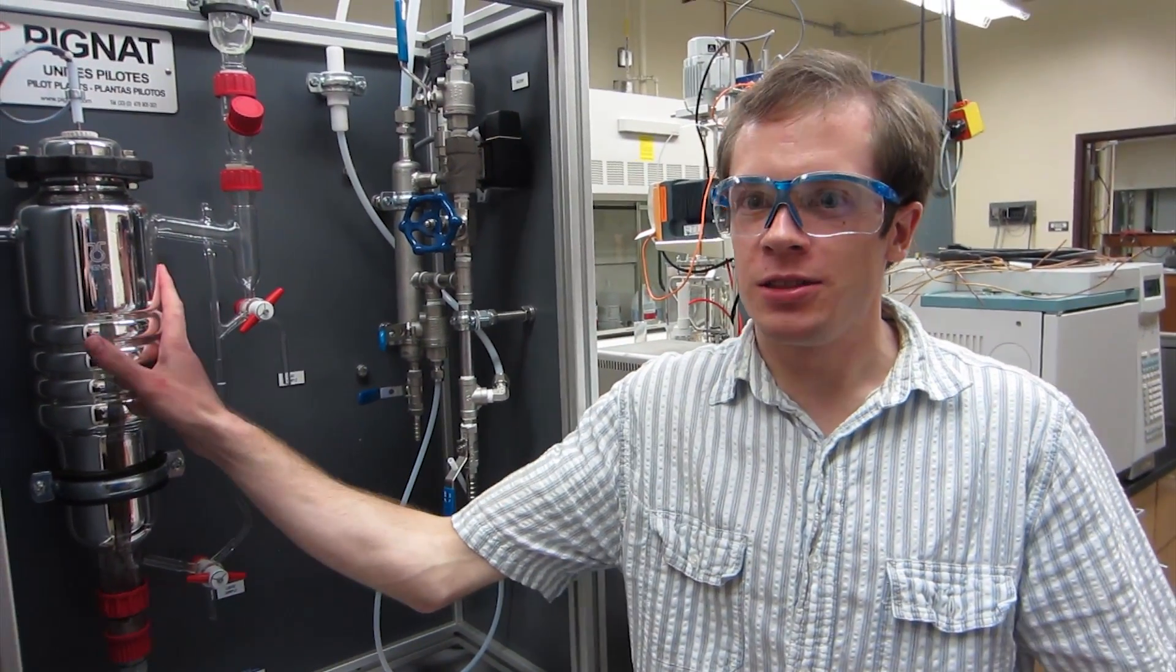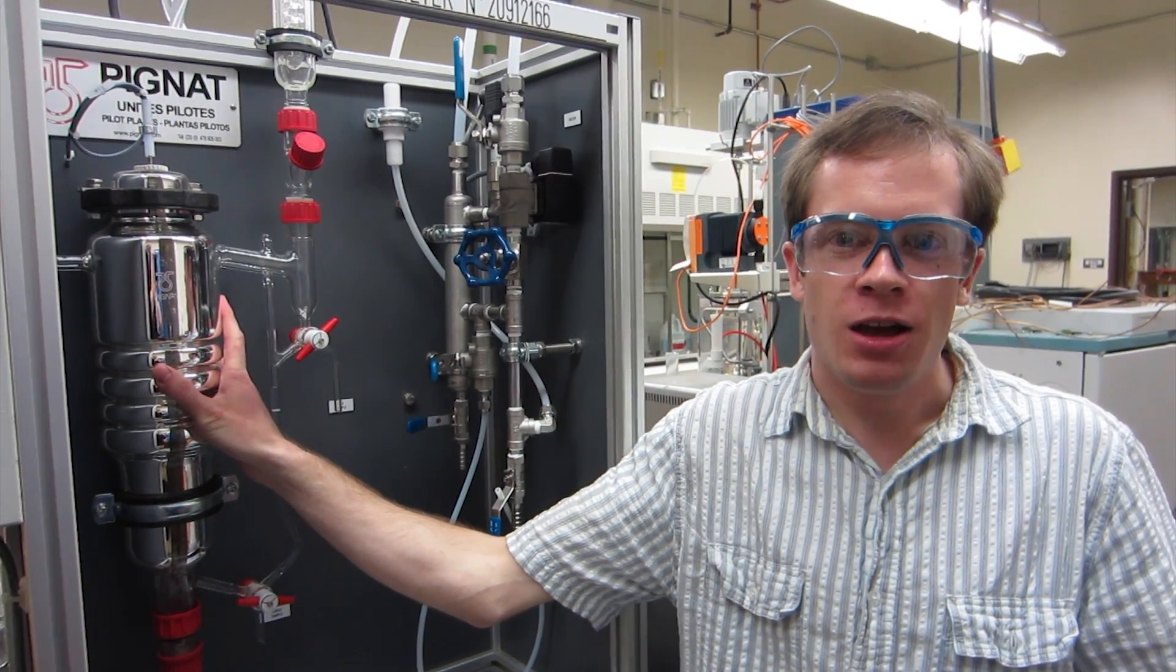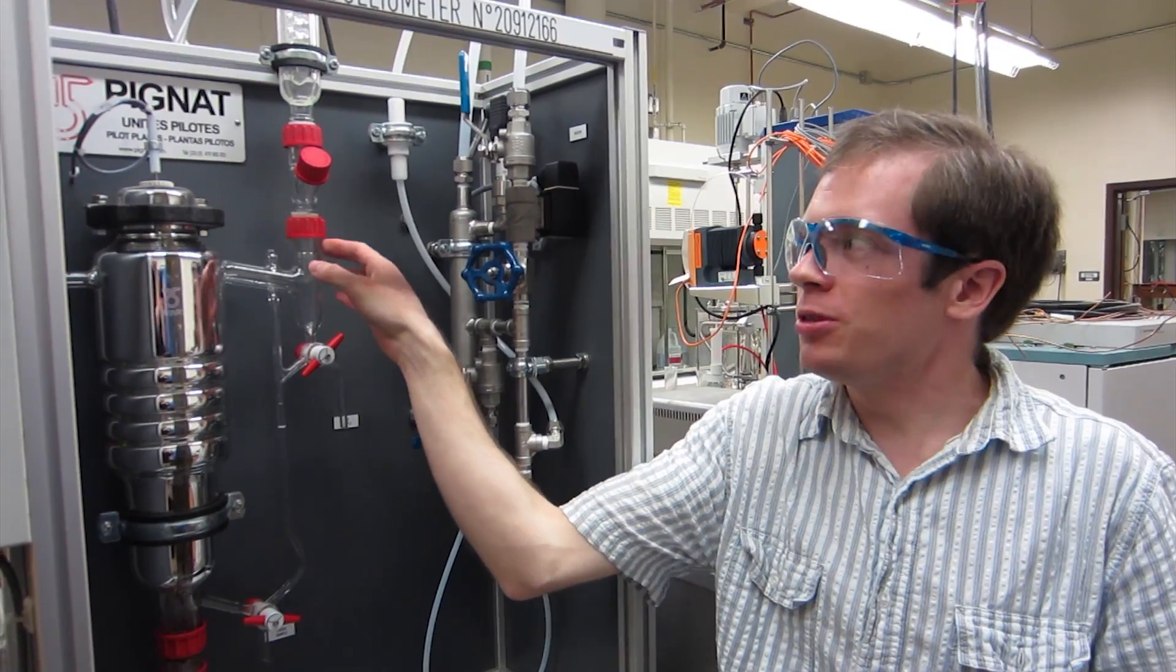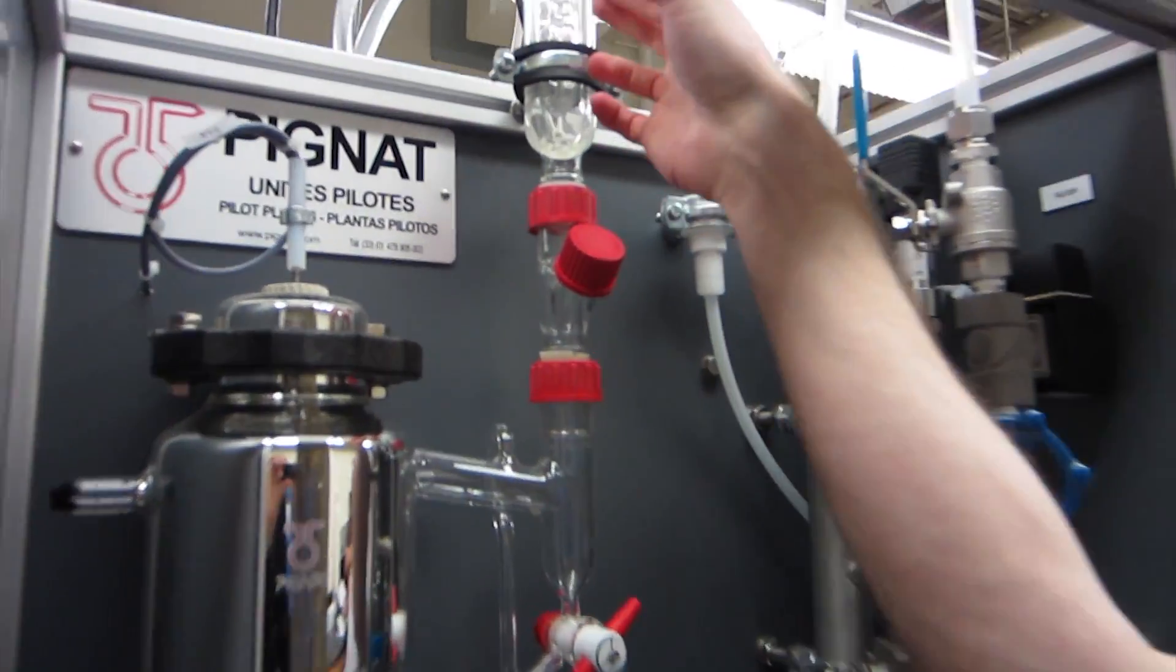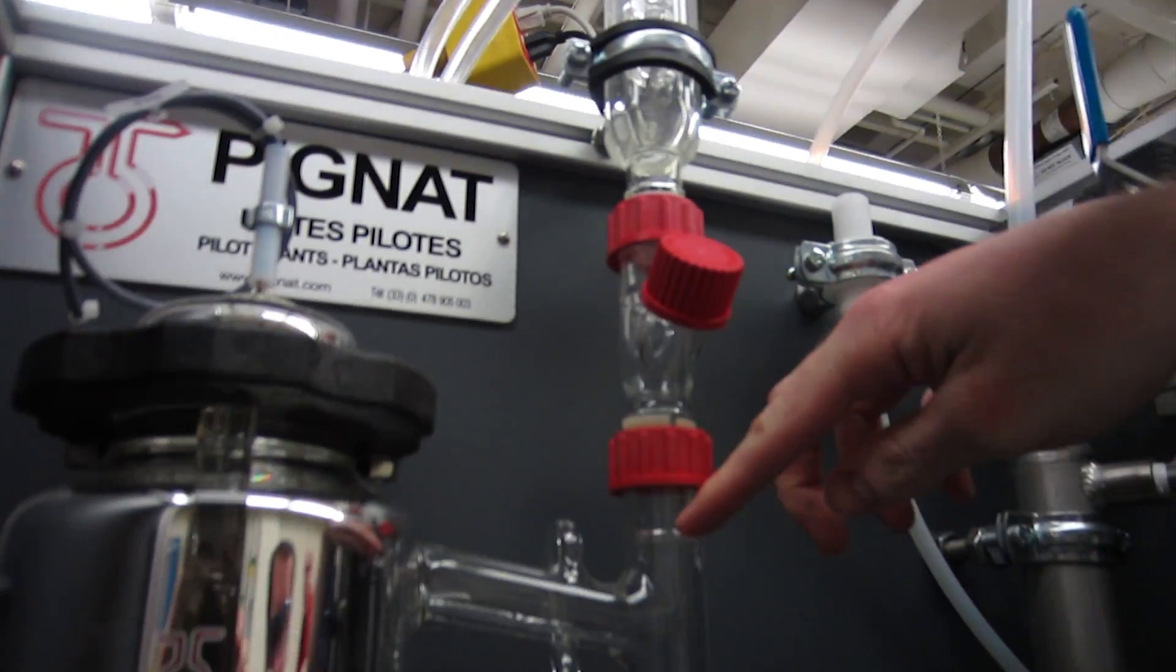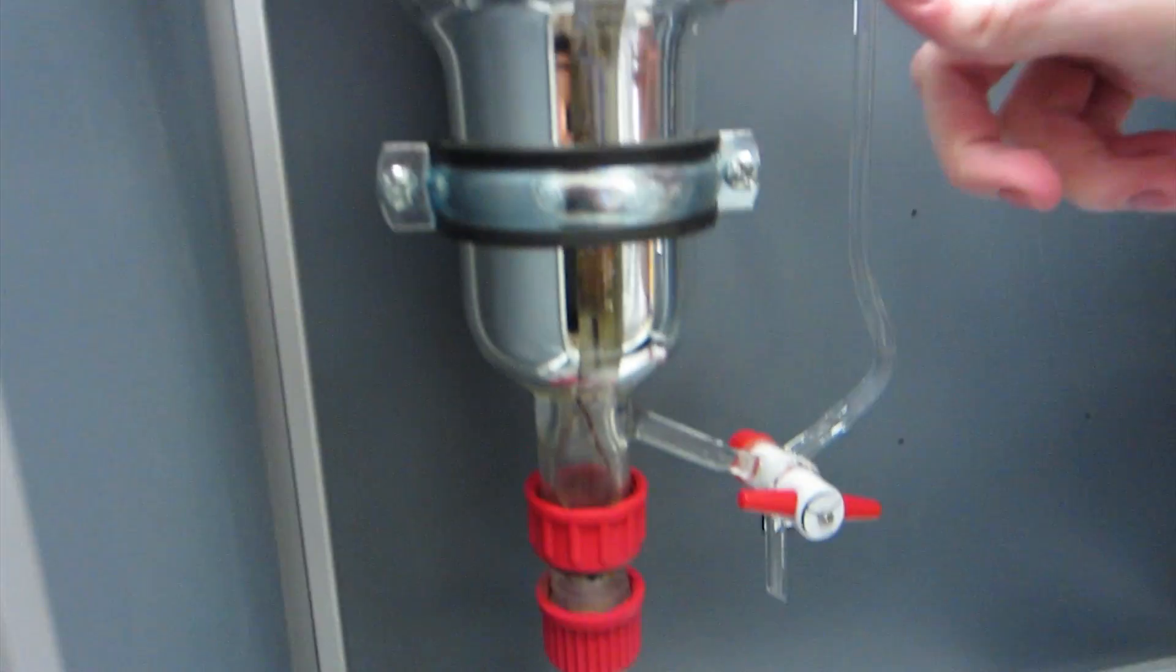So here we've got the reboiler, we just call it the pot usually, where we're boiling the mixture we've got. The vapor comes up through this area up into the condenser here where it all condenses, falls back down through here, and then is fed back into the reboiling pot.